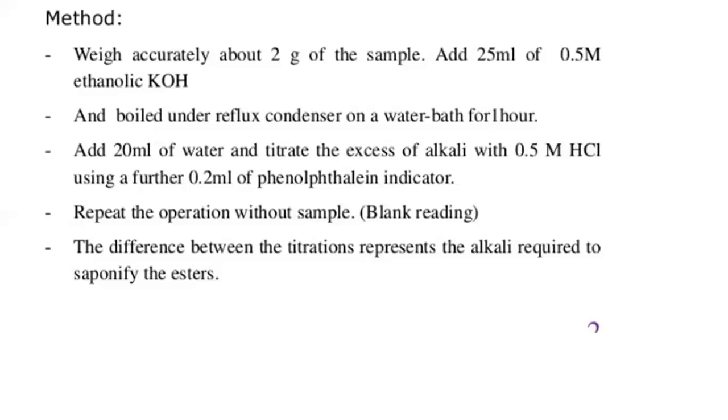So these are the different constants and values used for analysis of fats and oils. The remaining values like iodine value and acetyl number, all these things we will discuss in the next class.